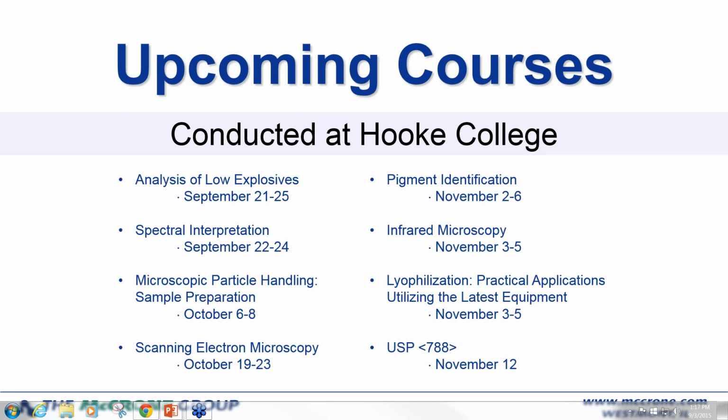ATR can be used for quantitation, but you have to be very careful because, for example, if you change the refractive index of a material, or if you're changing the depth of penetration or something of that kind, or changing the material in any way, you can change the intensity of the bands. So it really depends on the circumstances. You have to think carefully about whether the particular material will be apt for that.